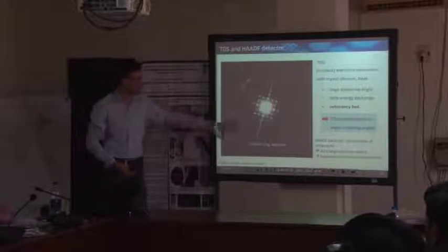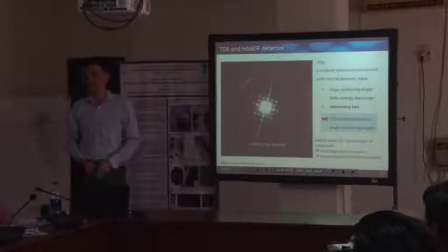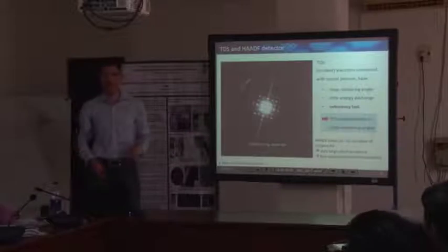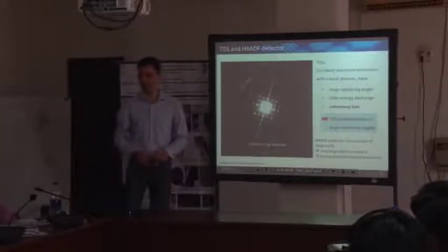And the sensitivity of the HAADF detector anyhow is pretty good. It's dedicated for low intensities, because the further you go out here, the lower the intensity will be. So the sensitivity of a pure HAADF detector is pretty high.